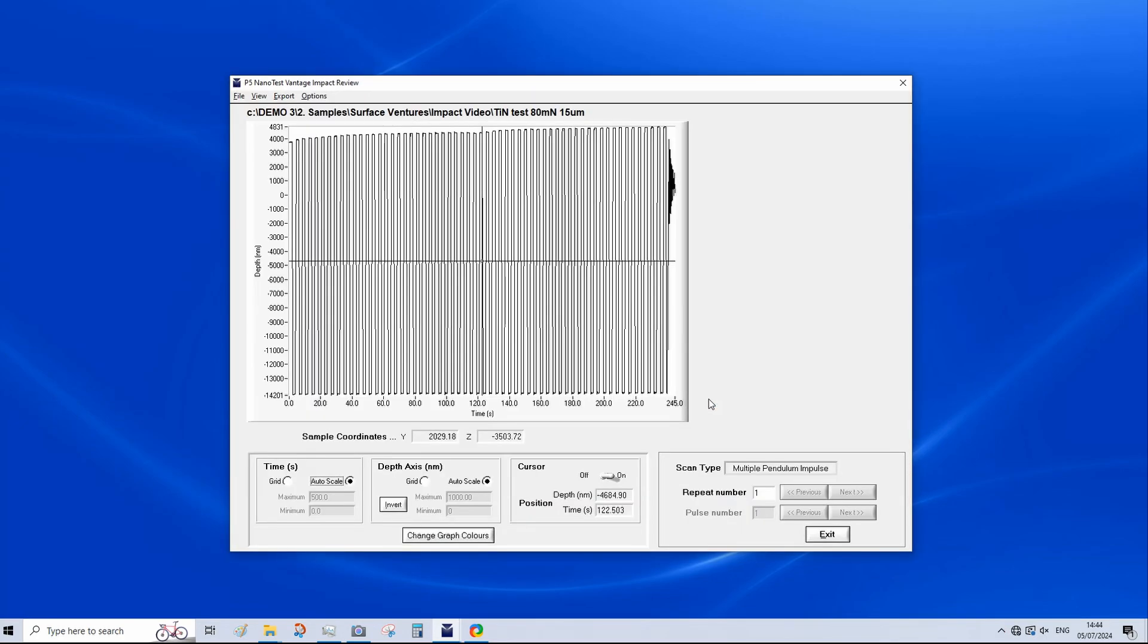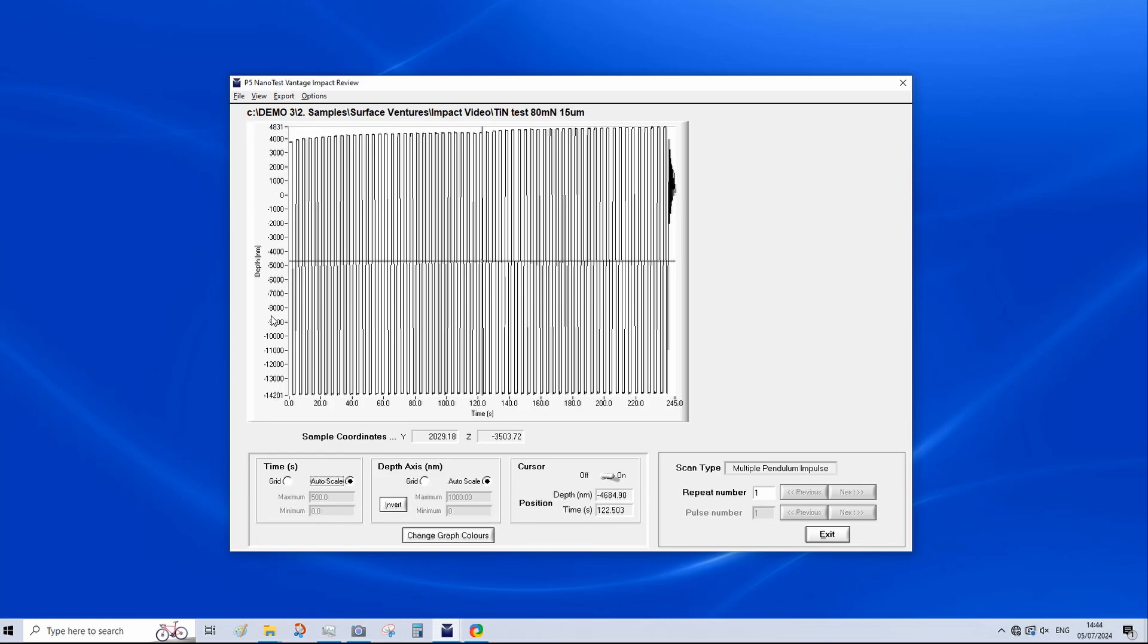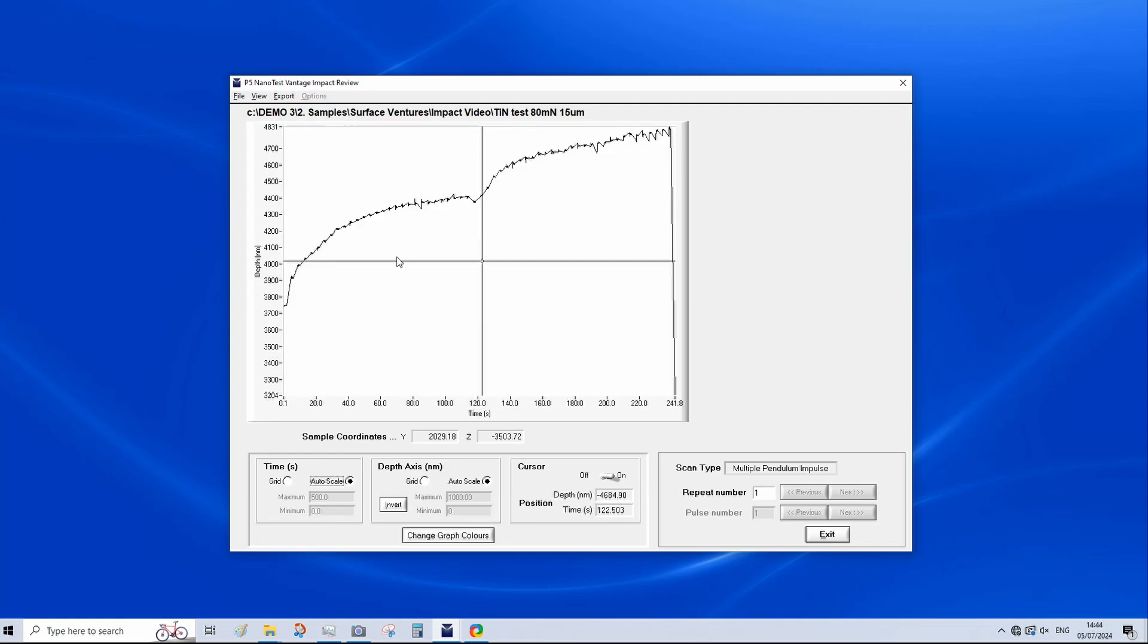So the raw data outputted by an impact test is much simpler than nano indentation. As we're just monitoring the evolution of depth with respect to time. As we open the impact data file, you can see the graph of depth versus time here. You'll notice that we have a large amount of negative depth data. This is the recording depth from the indenter withdrawing from the sample before an impact. We have a couple of options to process this negative depth data out of the data set. By clicking on options, we can either remove the data on the backstop or remove the spikes and data on the backstop. So we're going to select this option now. As you can see, that's changed quite dramatically.